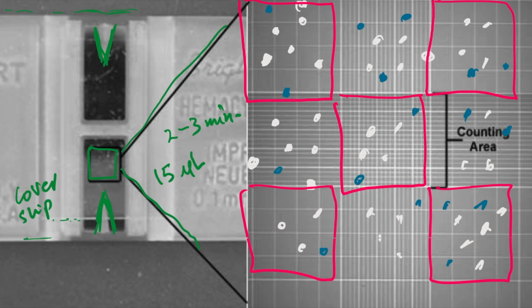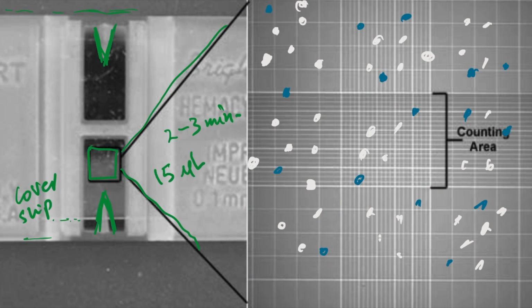Before that, you notice there are 2 types of cells in this particular specimen. There are blue cells and then there are white cells. One of the reasons for that is we typically use a trypan dye. A trypan dye penetrates through the membranes of the dead cells and colors them blue. The dead cells are going to come up as blue.